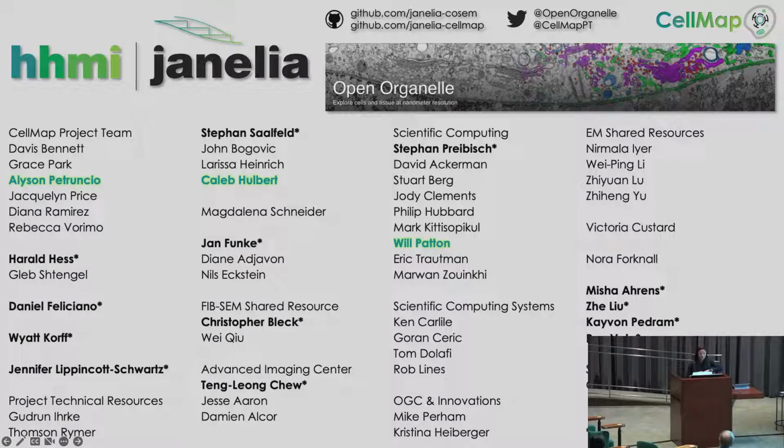I think that has been helpful for us because we've now tripled the amount of training data we have, and it now sees stuff not only from the cancer cell lines, but also tons of different tissues, and things don't matter as much now. I think the reason is field of view. If you zoom in close to mitochondria, it's going to look pretty much the same across all these different cells, and that's really the strength of it.